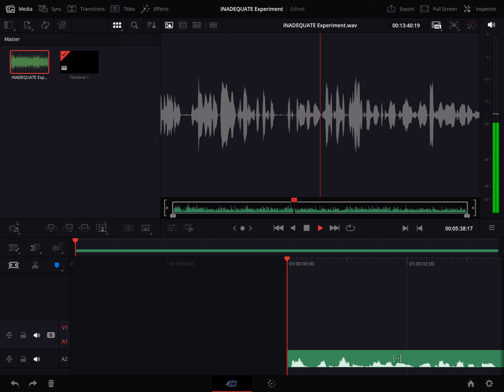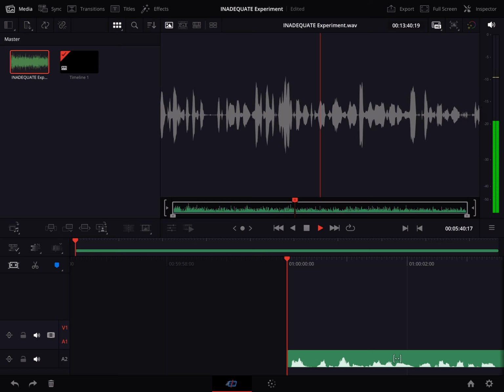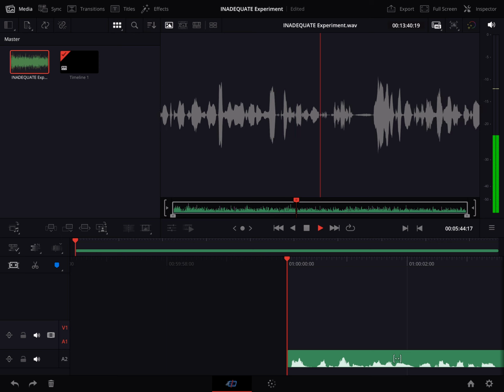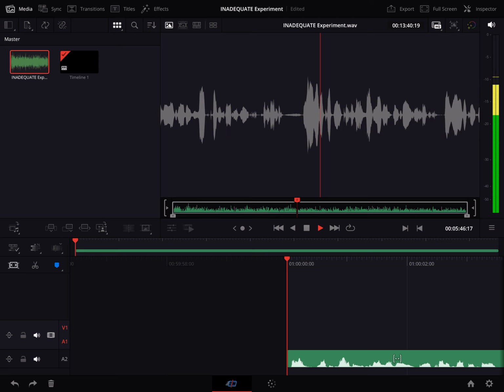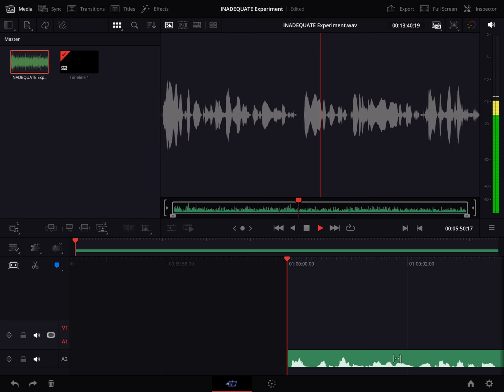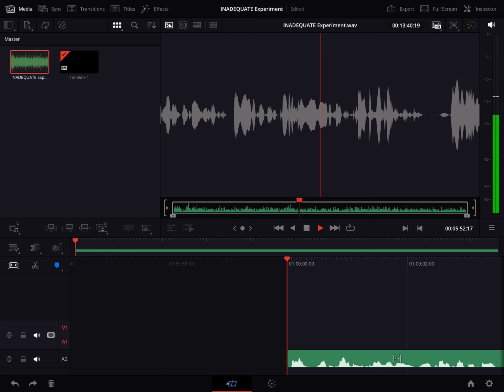That's pretty impressive. So it sounds like inadequate is the tool of choice when you absolutely need to know the exact carbon skeleton of a molecule. Precisely. No other technique can provide that level of detail and certainty. And why is that so important? Can you give us some real-world examples?